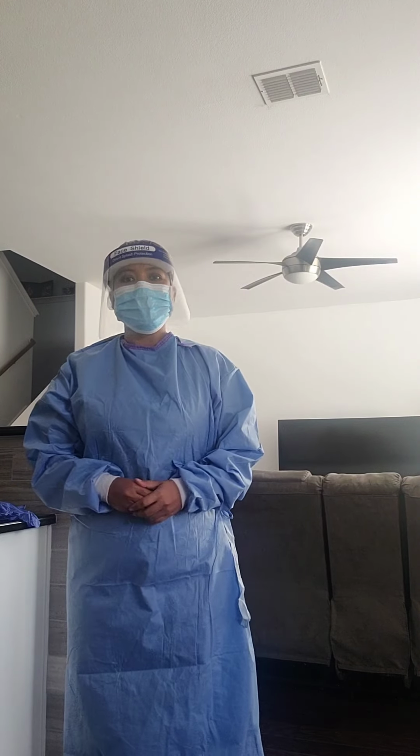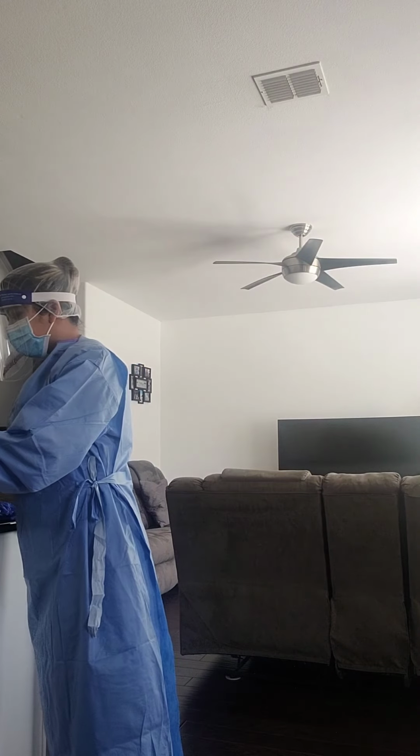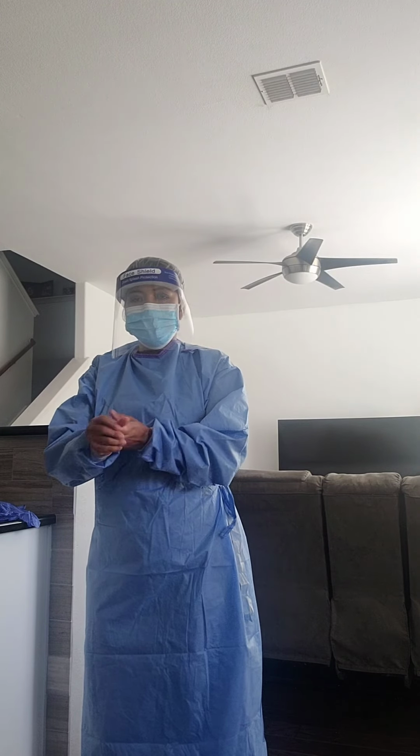I have my gown on. I have entered the clean room. And now I'm going to clean my hands again with hand sanitizers. And I'm just going to air dry my hands.